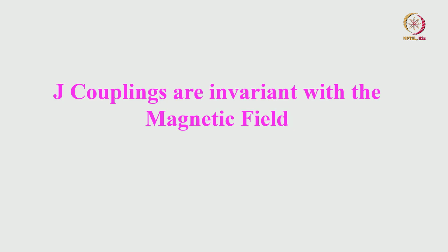Okay, so with this more or less I have covered a lot about the scalar coupling information I gave you. Today in fact we discussed a lot about varieties of multiplicity patterns and took a number of realistic examples. Looking at the complex multiplicity pattern, how do you put a nomenclature for each of these multiplicities? What is the doublet, triplet, doublet of triplet, triplet of quartet, all possible examples we took. And afterwards I showed the strength of the J coupling. One bond coupling in a hydrogen molecule is quite large, 276 hertz.